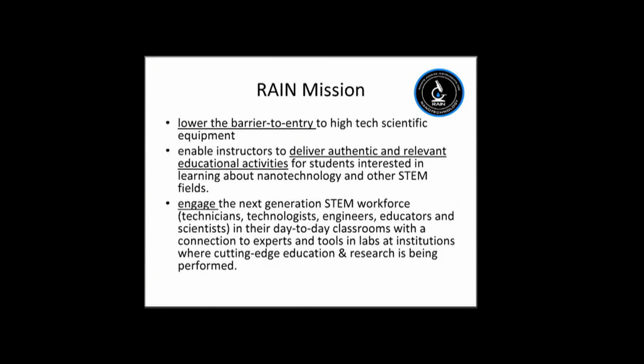So what's our mission? We want to create a lower barrier to entry to high-tech scientific equipment. Each of the RAIN partners have different pieces of equipment. Some of them are the same, but we want to bring those into your classrooms. We want to enable you to deliver relevant educational activities for your students interested in learning about nanotechnology in particular and other STEM fields in general.